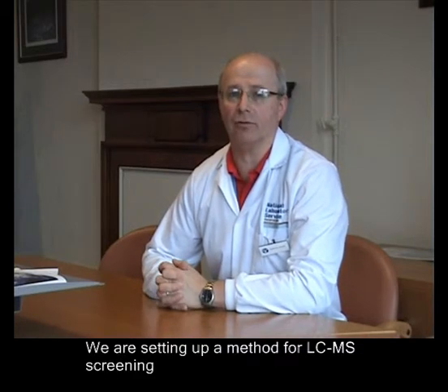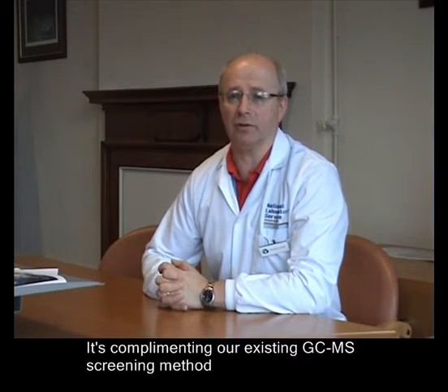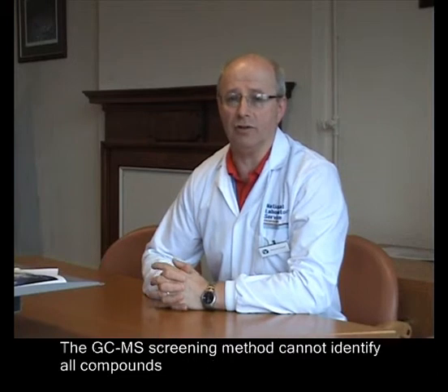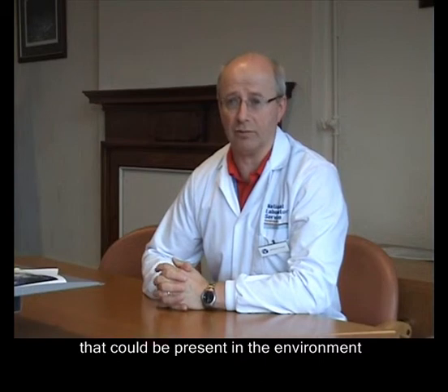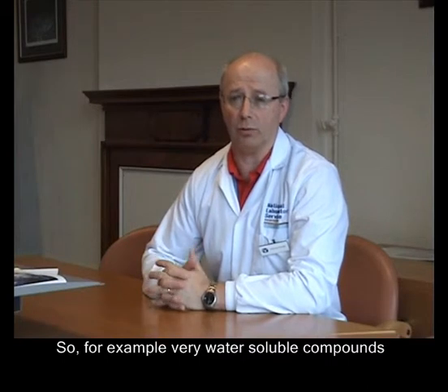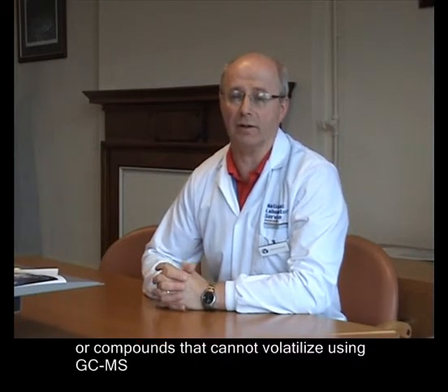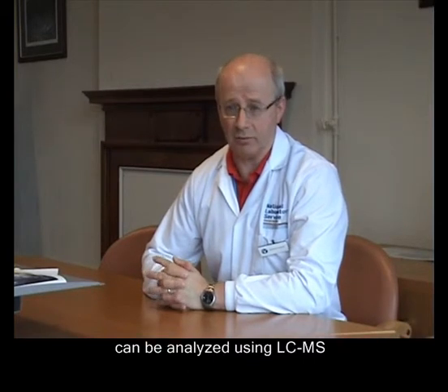We're setting up a method for LCMS screening. It's to complement our existing GCMS screening method. The GCMS screening method cannot identify all compounds that could be present in the environment, and that's due to their polarity. So, for example, very water-soluble compounds or compounds that cannot volatilize using GCMS can be analysed using LCMS.